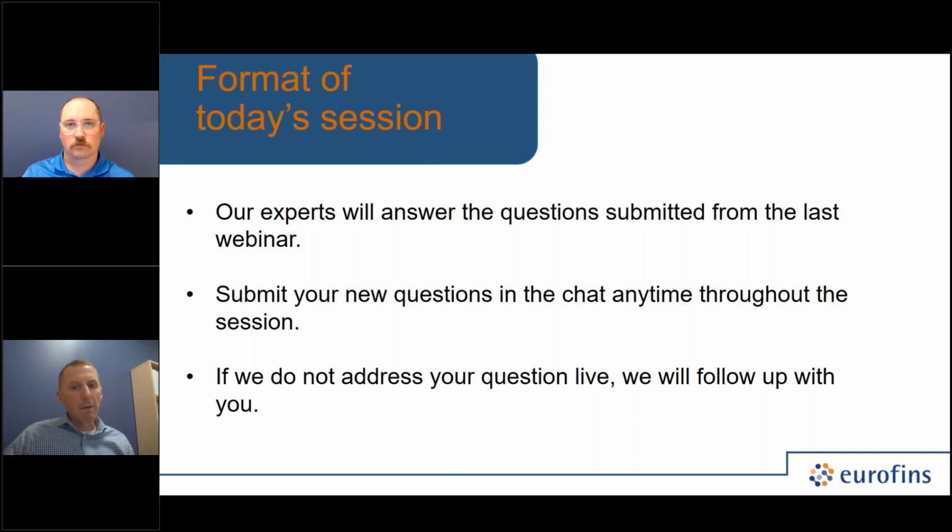So that's interesting. Okay, let's move on to what I think is probably the biggest and probably most important question on this list, which is how do regulatory bodies treat AFU claims versus CFU claims? And are there companies that are in the marketplace today using AFU for release and labeling their probiotic products? Because that's kind of where we'd like to get this technology to, I think, in many of the people's minds who might be attending this call.